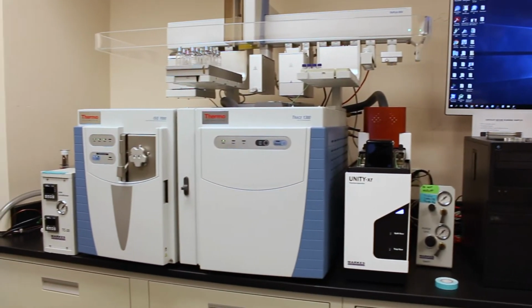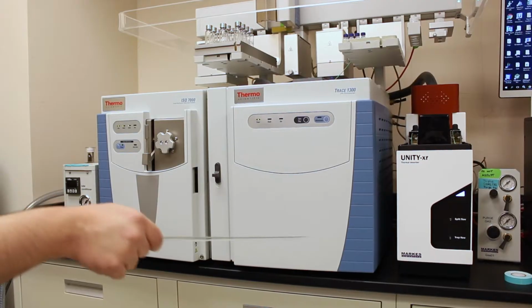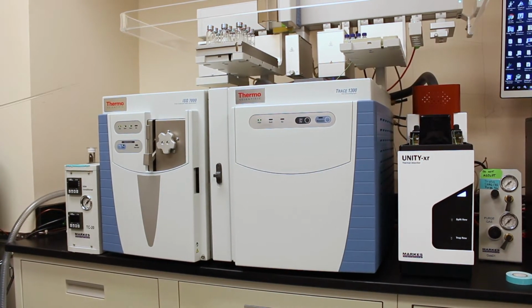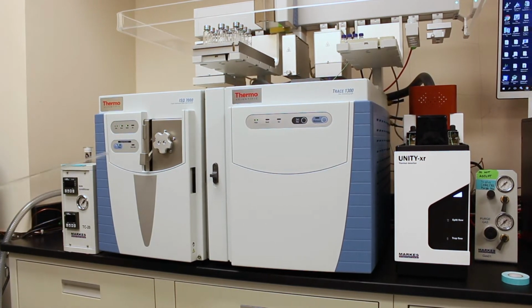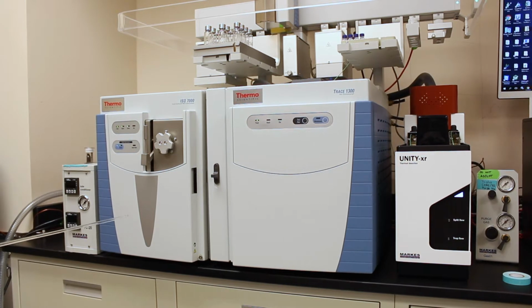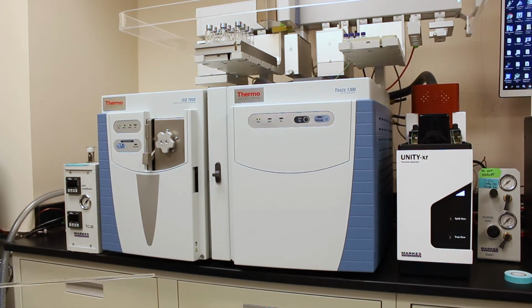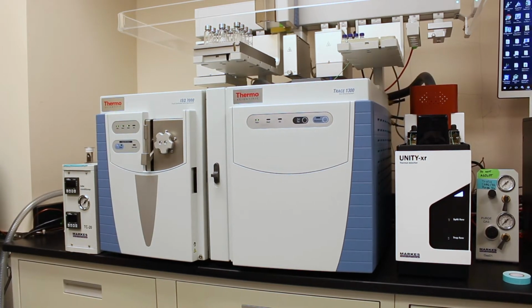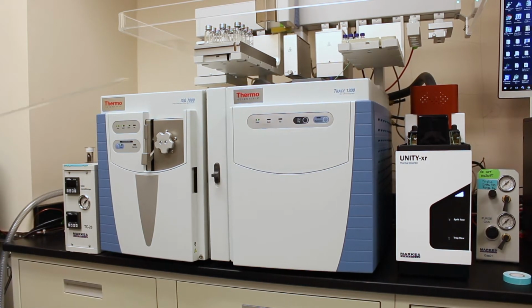So the key takeaway here is that this portion, the gas chromatograph, separates mixtures, and then on the leftmost portion, the mass spectrometer, which is the greater emphasis for this video, is what's going to measure the mass to charge ratio and subsequently the mass of the molecules. It's very loud in here because this mass spectrometer works under a vacuum. So there are several vacuum pumps in here that keep this system under a vacuum.